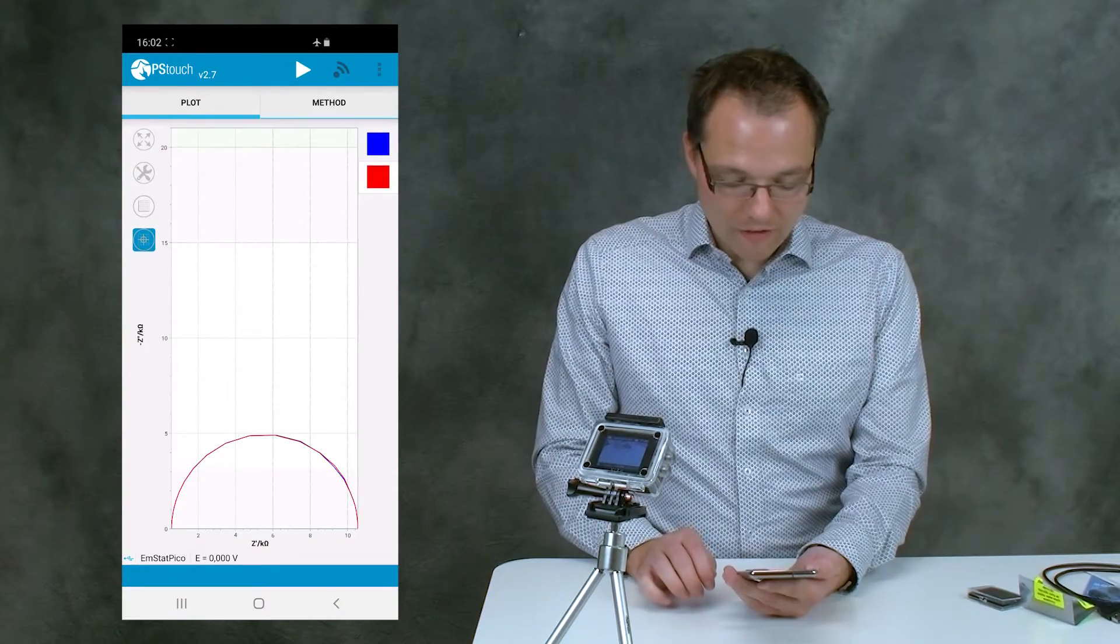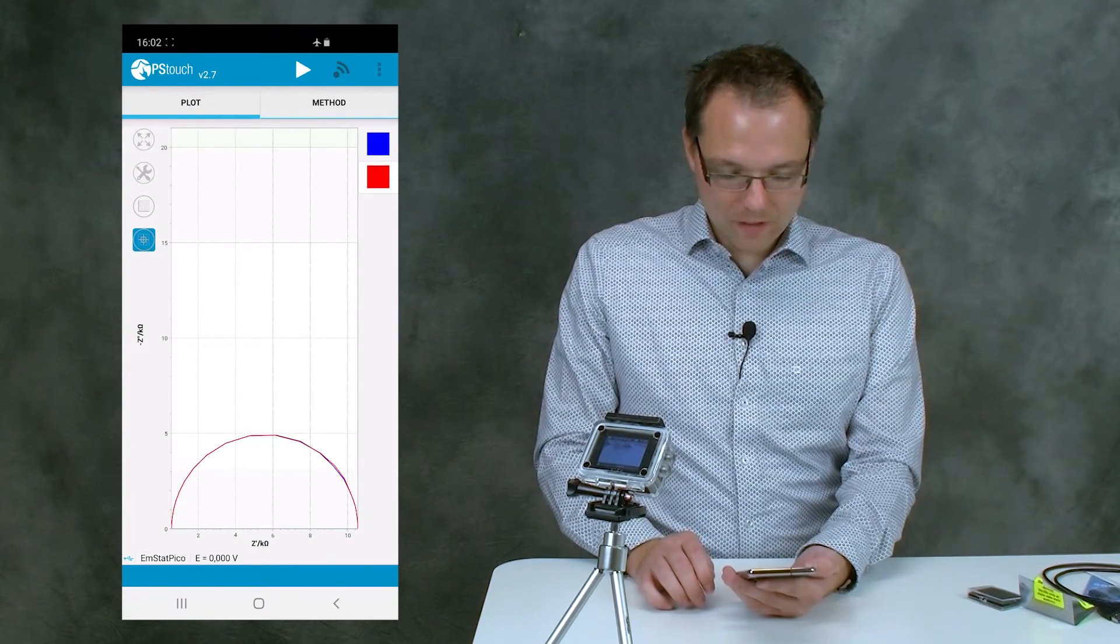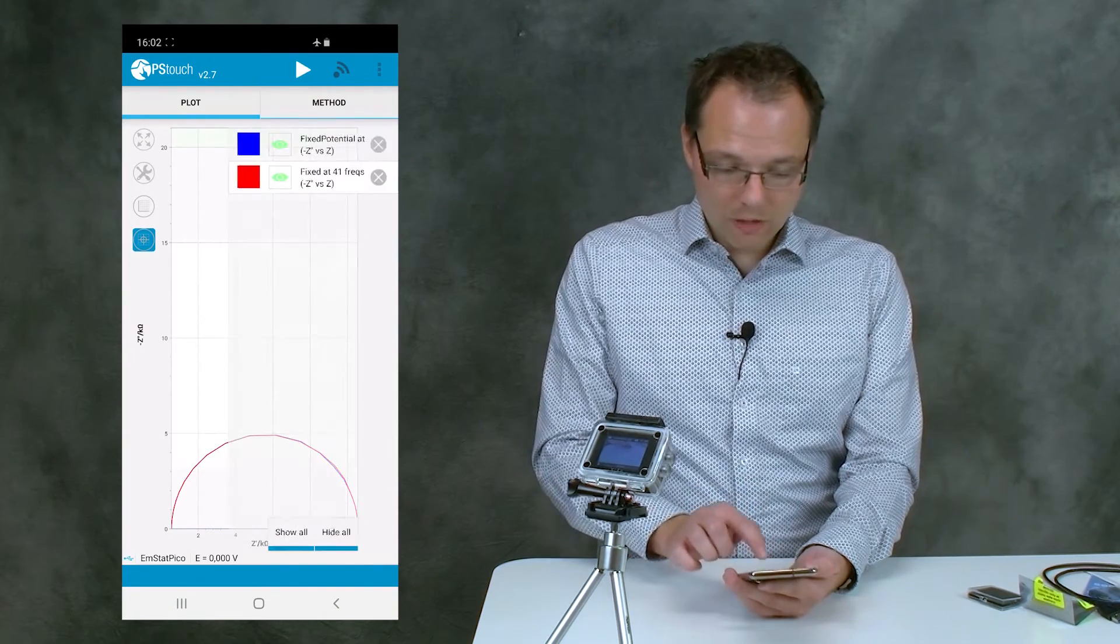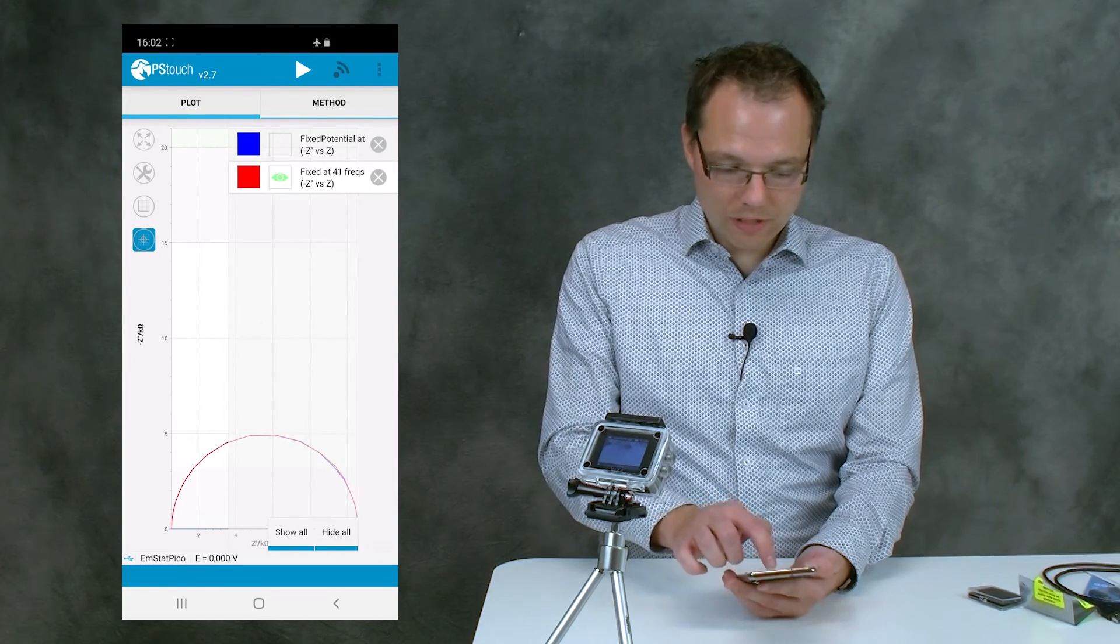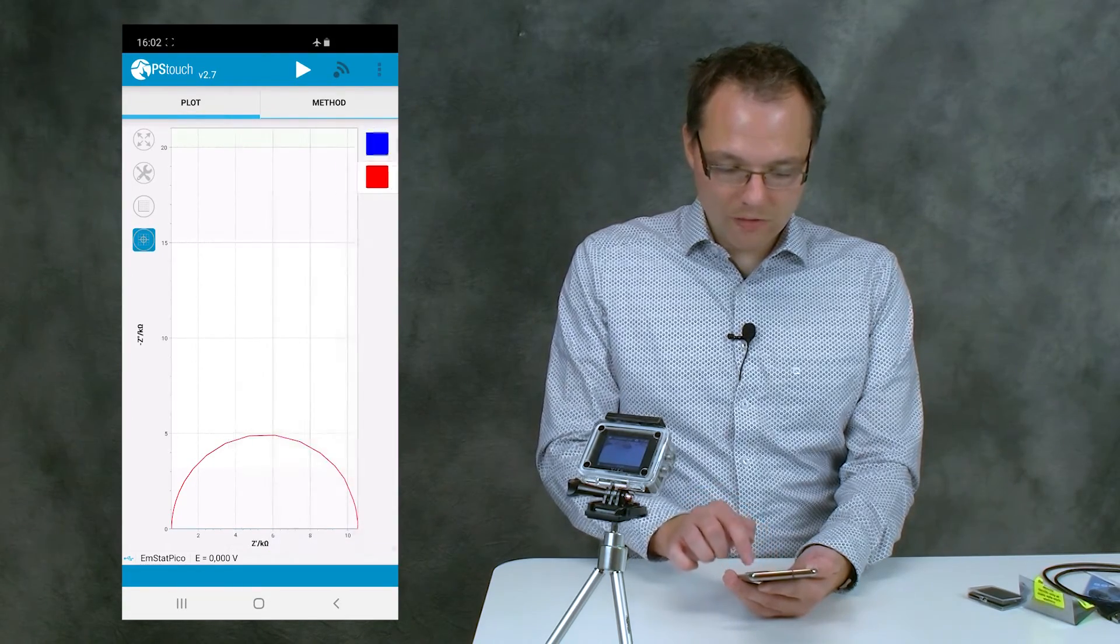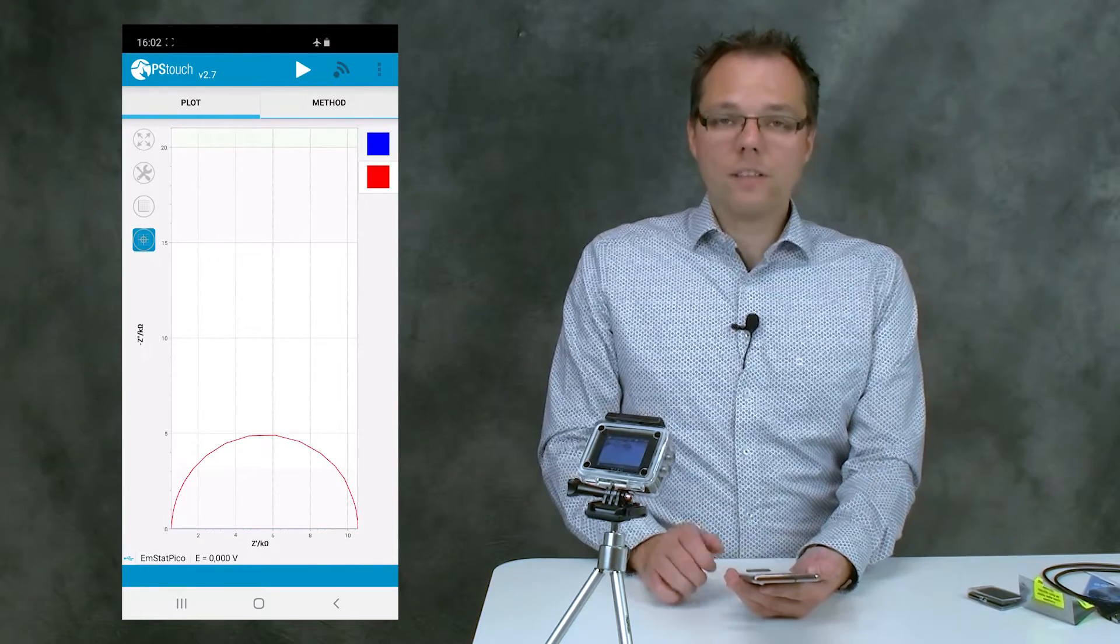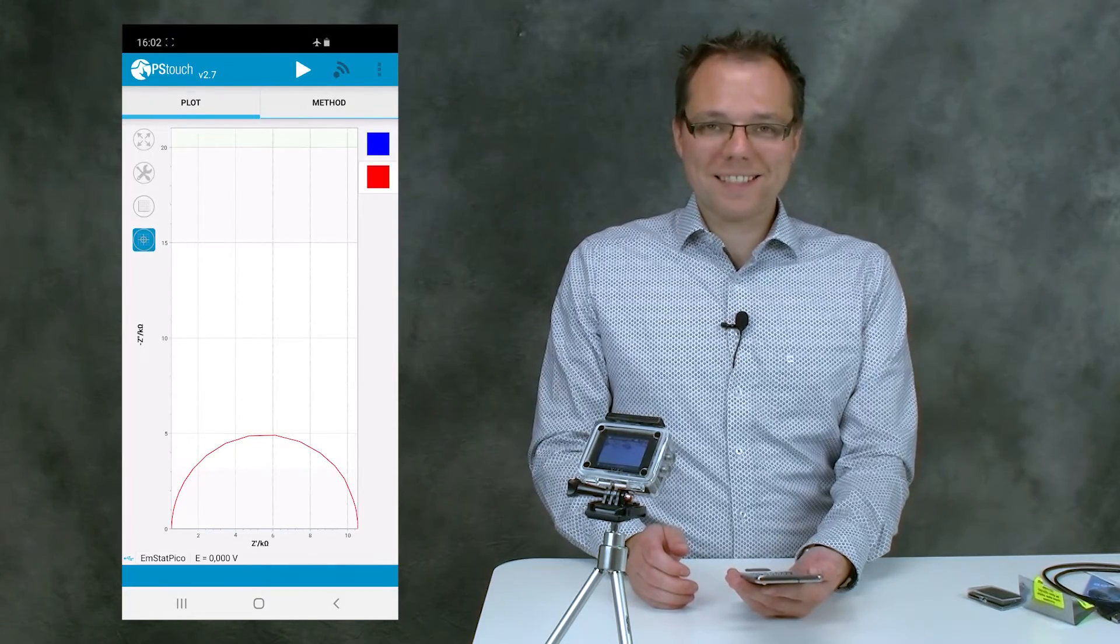Yes, so we recorded our final measurement, and now we can see that these two curves overlap. You can also, if you want, just swipe out the legend and press the little I button on the blue one so you only see the new measurement that you just made. And this way, you have easily made your first measurement with the Sensit Smart.